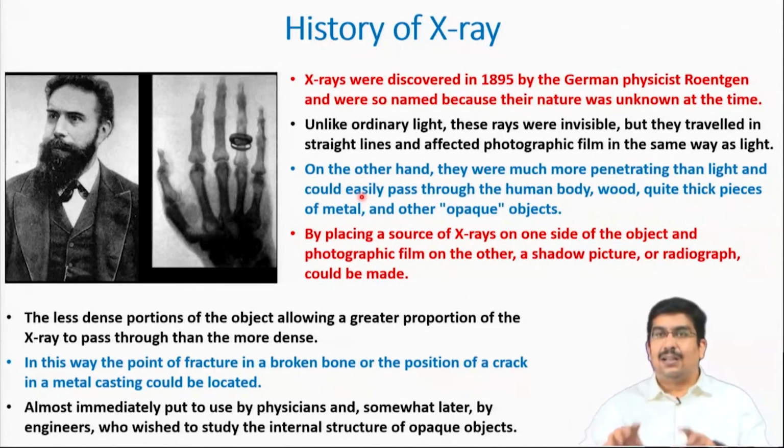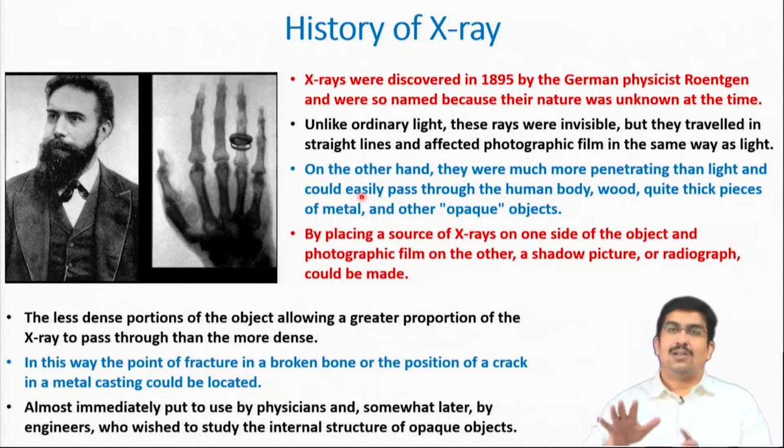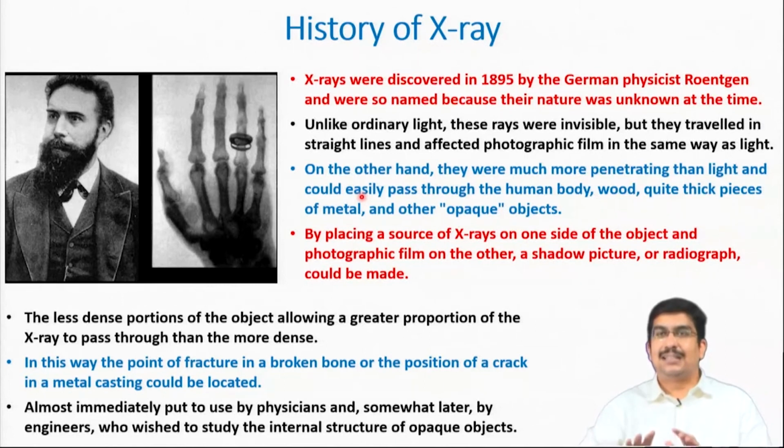Like in a microstructure, you can pinpoint a region and get the chemical analysis done from there. With X-ray signal, it is a little difficult to do. Micro XRD and all those things are there and are increasingly becoming popular, but it is still difficult. So the bottom line is that X-rays in some sense are equally capable or sometimes even better than electron microscopes, but they are lacking in that they do not come in one single equipment, and at times they cannot give you information with as good a spatial resolution as electron microscopy can.